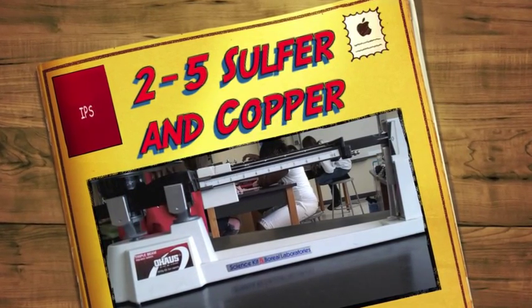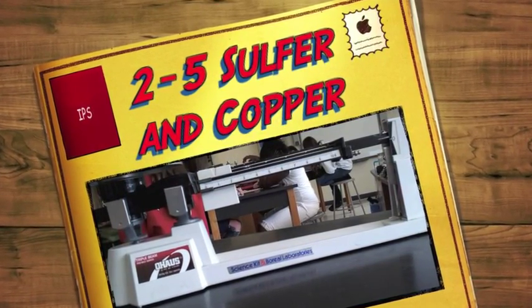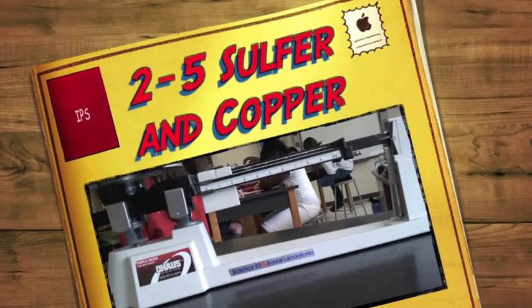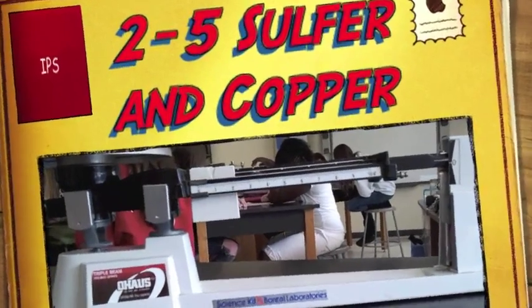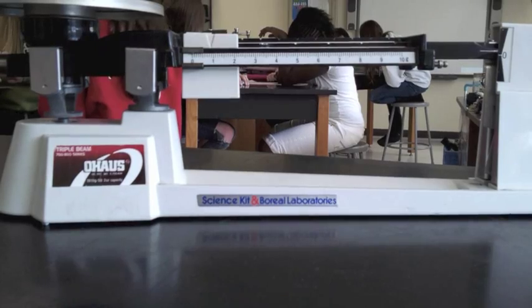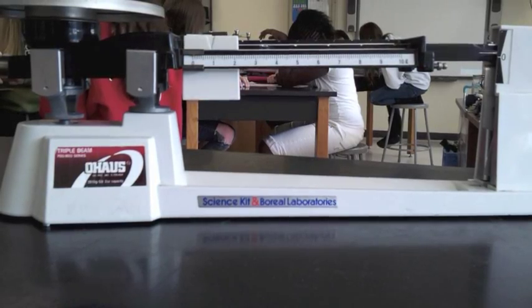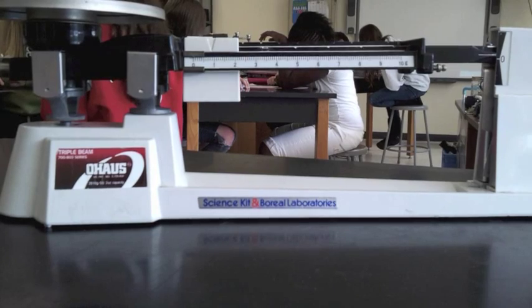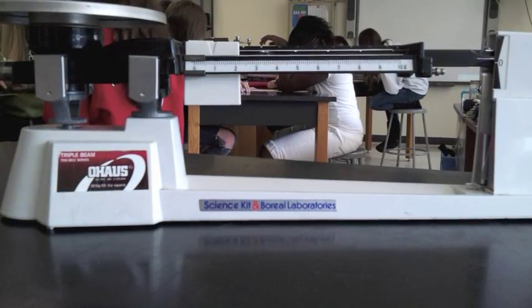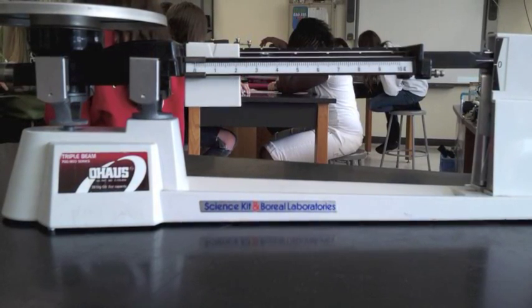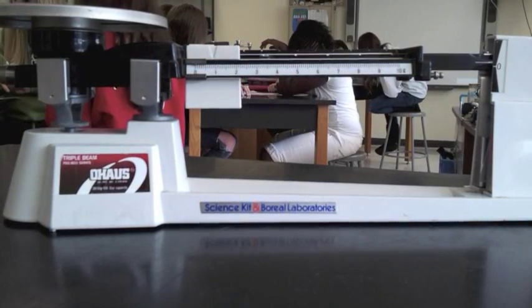This is lab 2.5, sulfur and copper. We're going to heat together sulfur and copper and see if the mass changes. This is pretty dramatic.